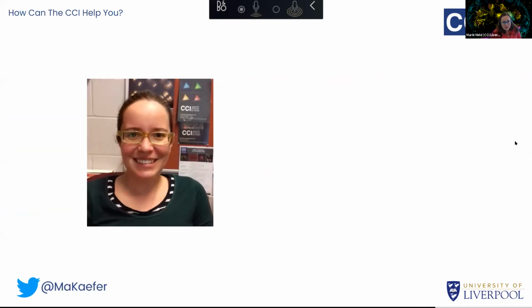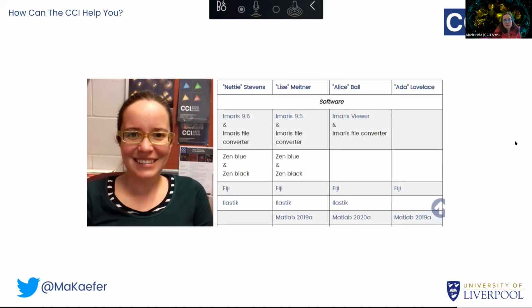So how can the CCI help you? Well, we have an image analyst who can answer these kinds of questions, and I'm more than happy to run you through some of these things if these questions do apply to you. If you have other questions, I'm more than happy to try and answer those as well. But what the CCI offers as well are some powerful image analysis workstations. They are set up so that you can access them remotely, and there are 4 workstations.